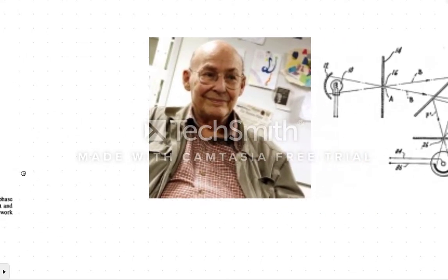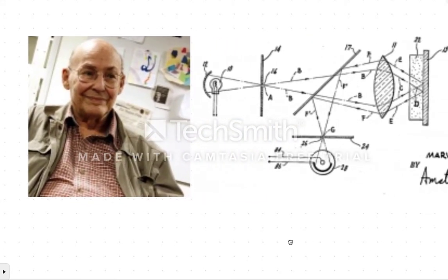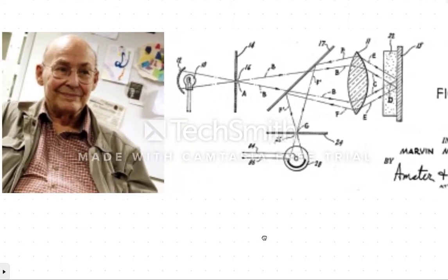Confocal microscopy, developed and patented by Marvin Minsky in 1957, uses optical imaging to create a virtual slice within the tissue. It provides high-quality images with fine detail and more contrast than conventional microscopy, and the imaging technique also allows for reconstruction of virtual 3D images of the tissue when multiple sections are combined.